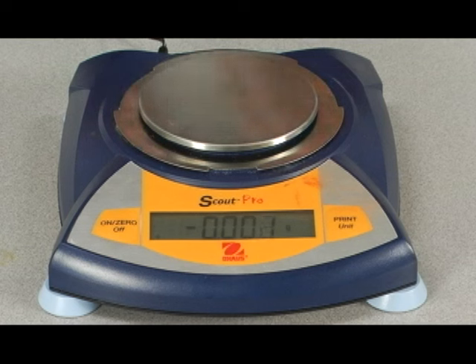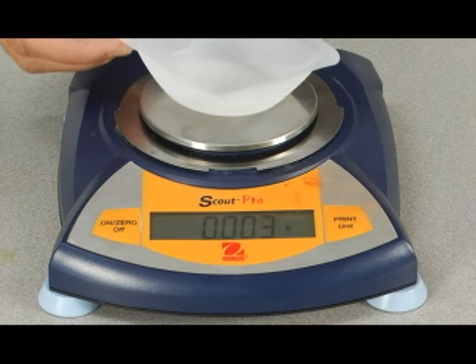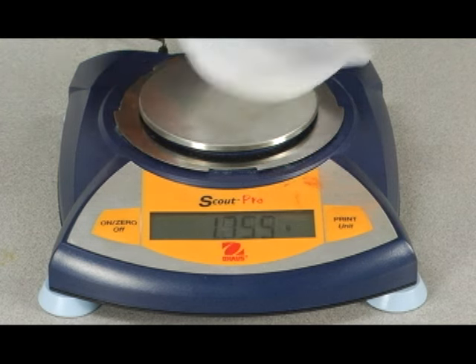There are two ways we're going to be massing out things on this balance. One, we'll be using a piece of paper, or we'll be using a weighing boat. I'll be using the weighing boat.